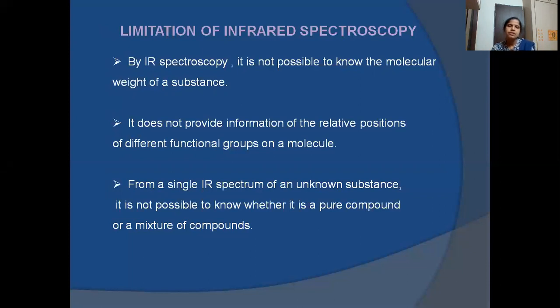And then we have seen the characteristic absorption bands for various functional groups, for example alcohol OH. From 4000 to 1500 is the functional group region, and from 1500 to 400 is the fingerprint region. When two compounds are similar and there are only small changes in the sample, those can be detected in the fingerprint region. And then we have seen the instrumentation also.